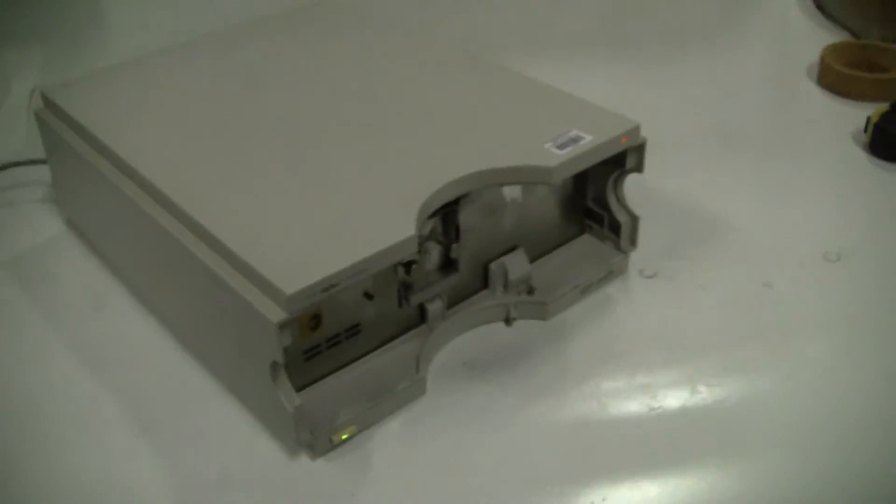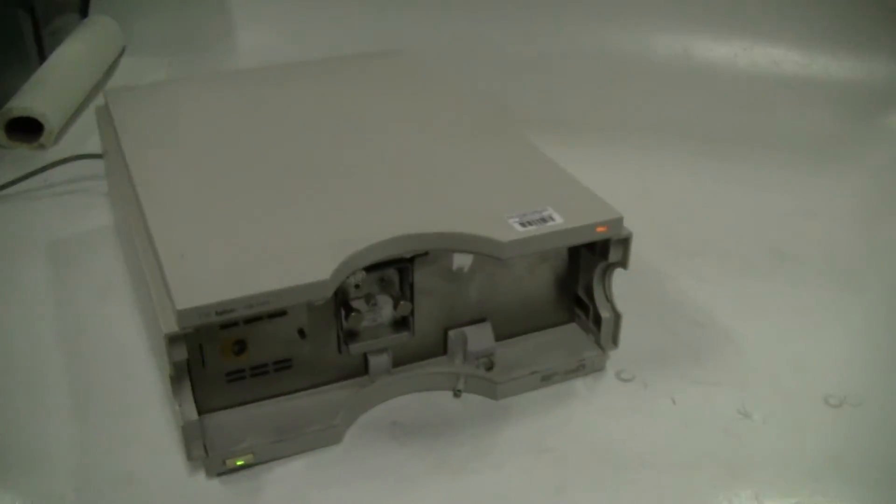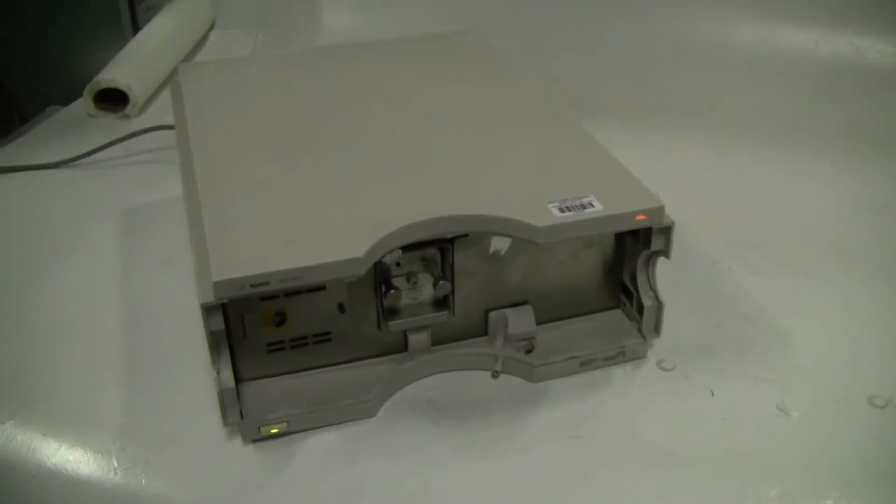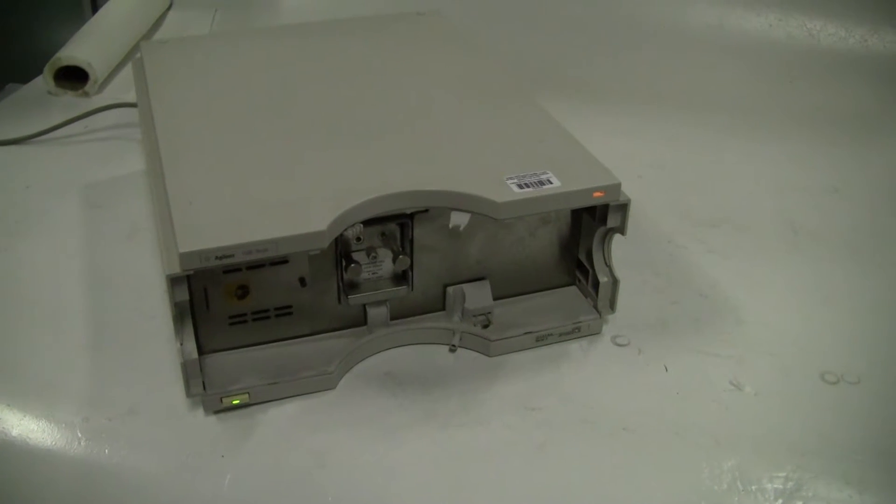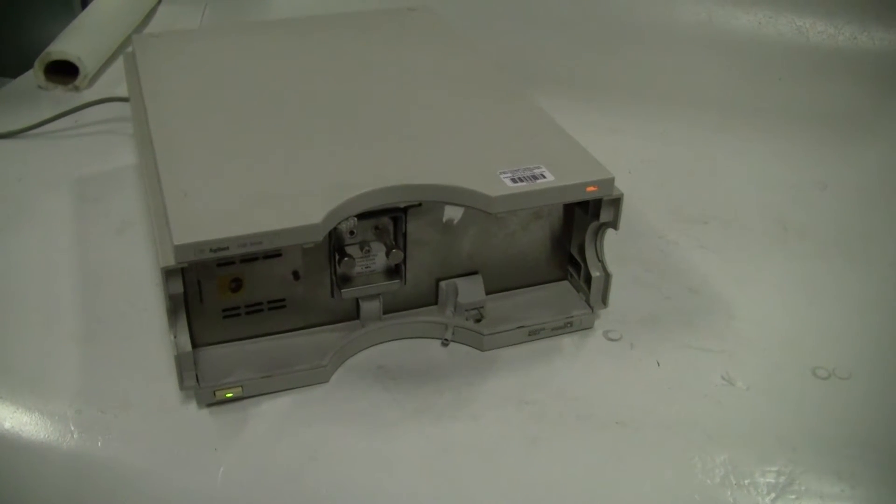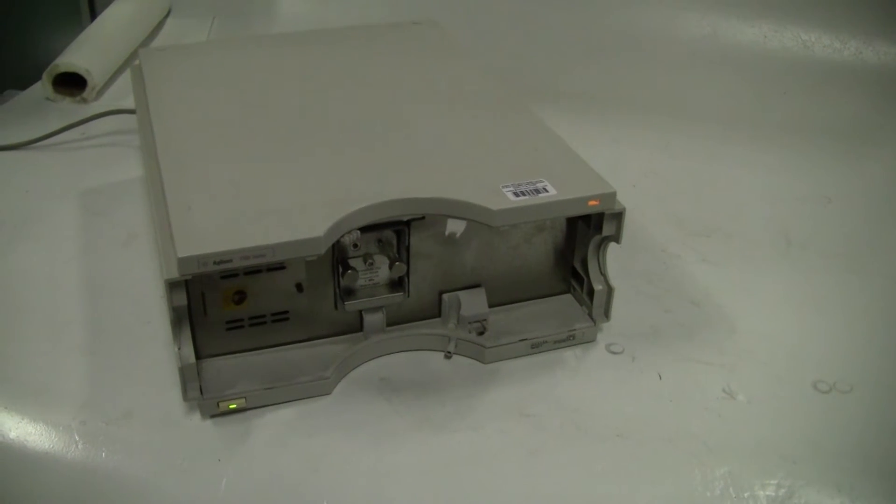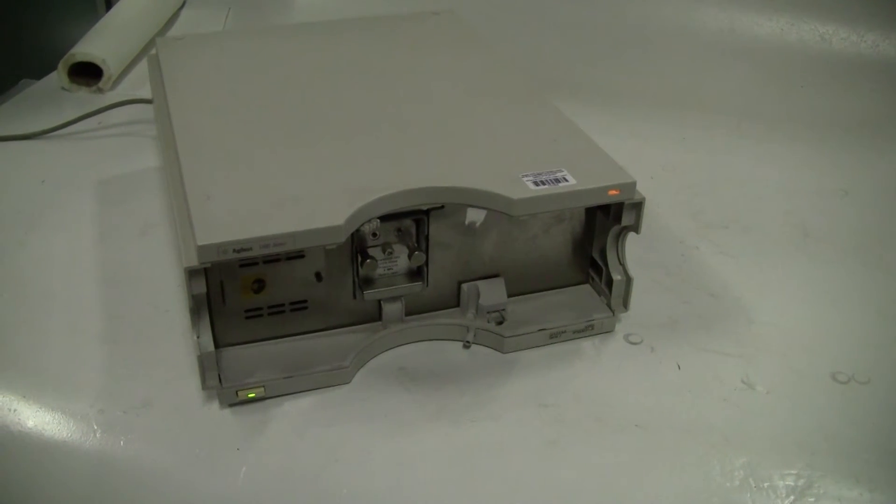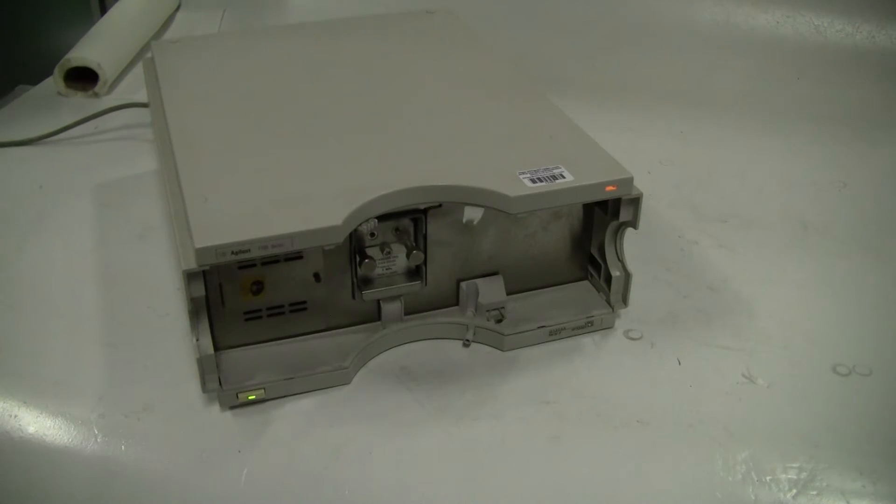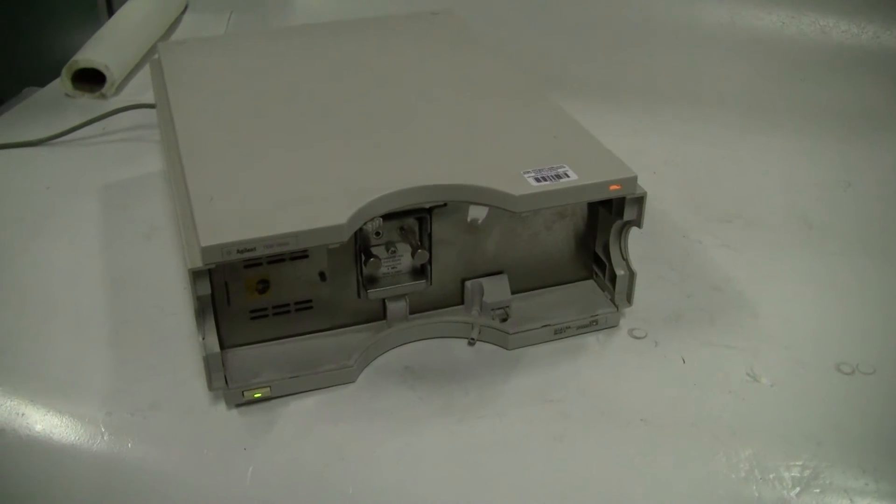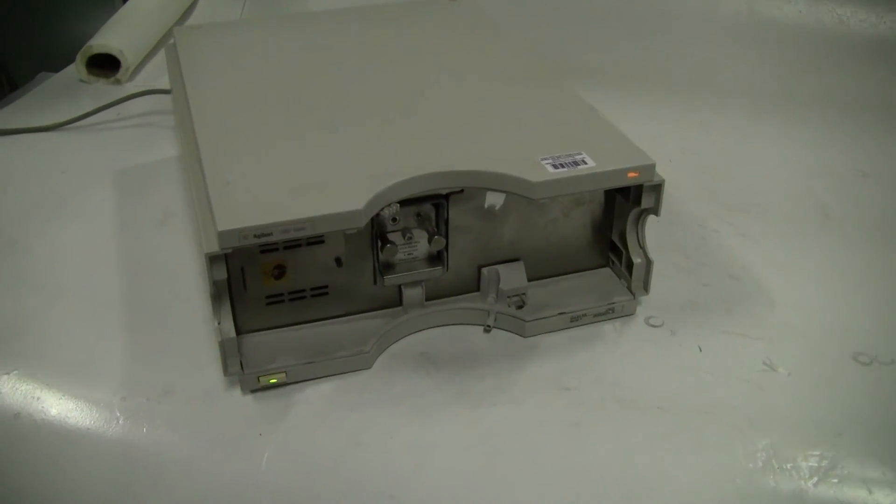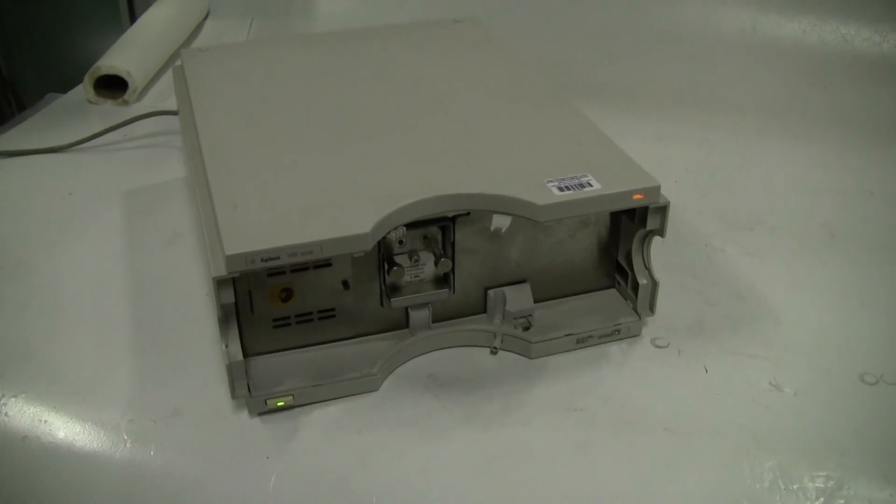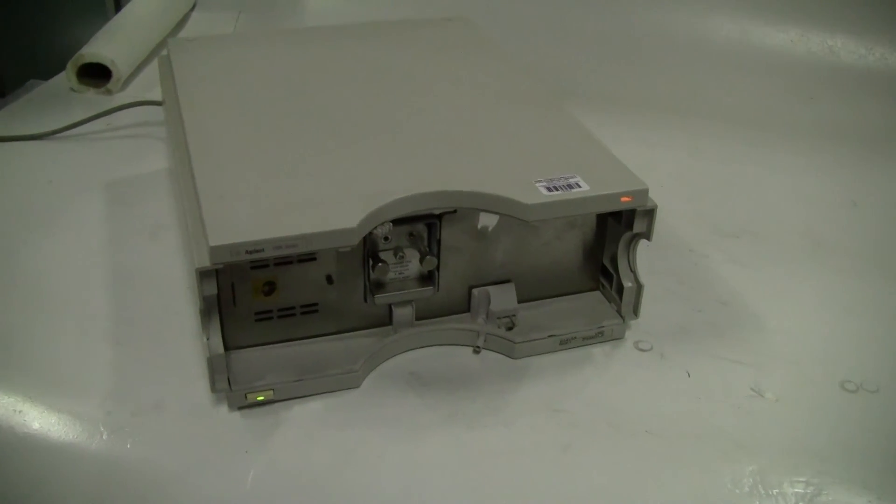If you have any further questions or would like to accelerate the Variable Wavelength Detector being tested in a full chromatography system, please call 609-518-9100. Thank you from HitechTrader.com.